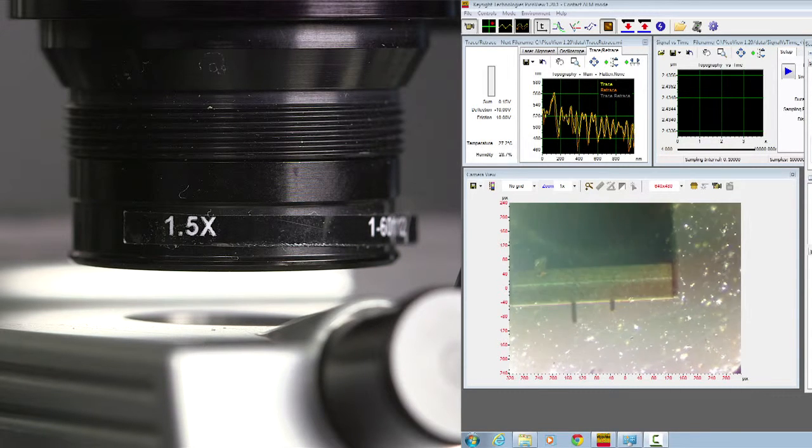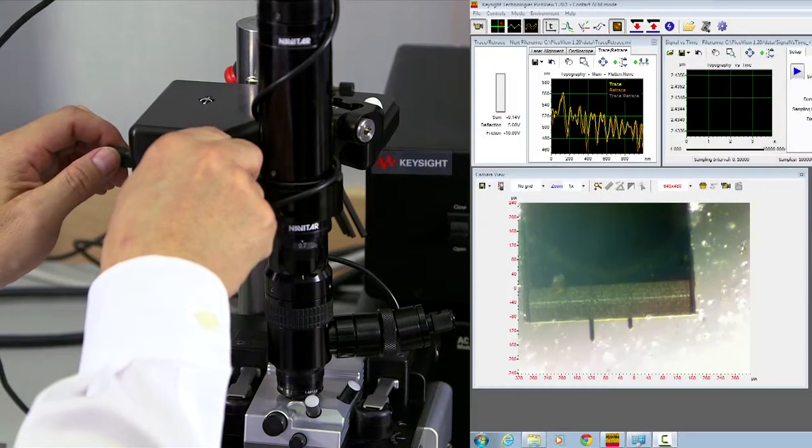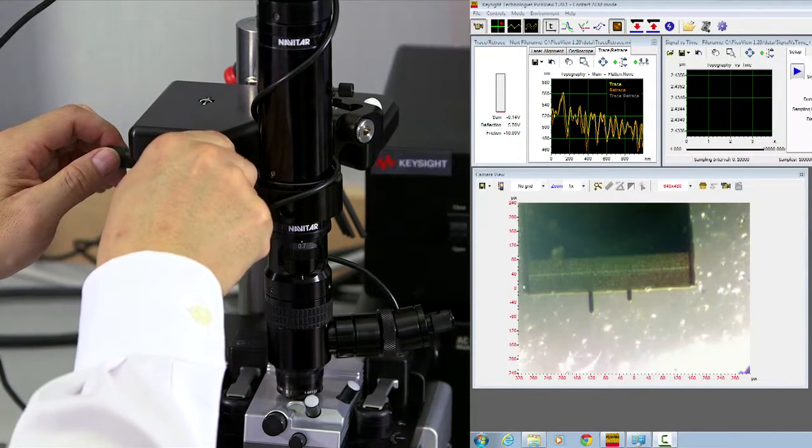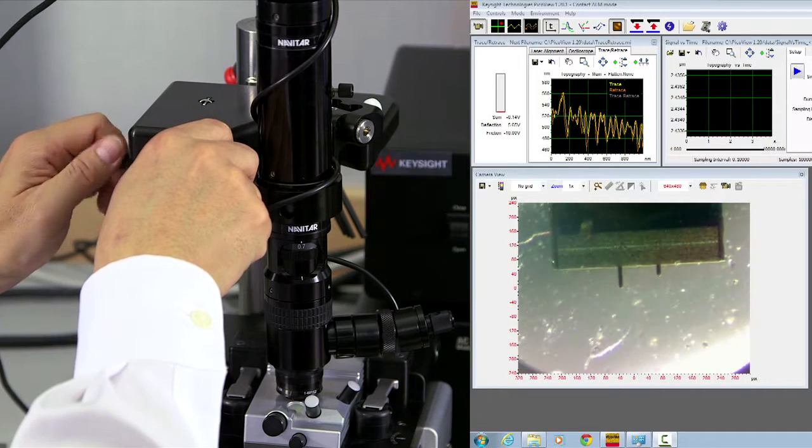Now, you can see that the cantilever tip is coming to focus and notice the distance between the optical microscope objective and AFM scanner is very close. It's about five millimeter in distance. Here, translation again. And move the cantilever tip into the center of the view.